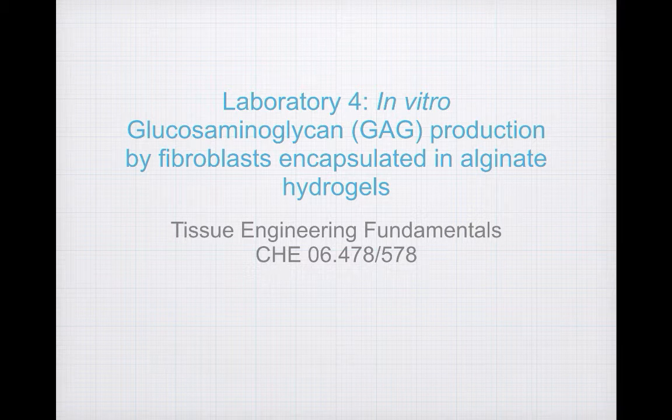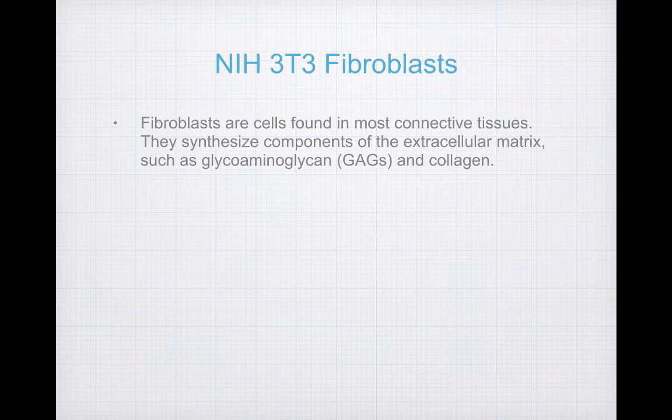Hello and welcome to Laboratory 4: in vitro glucosaminoglycan, or GAG, production by fibroblasts encapsulated in alginate hydrogels. Now that title is kind of a mouthful, so I'm going to use the background section of this lab to break that title down for you into different pieces.